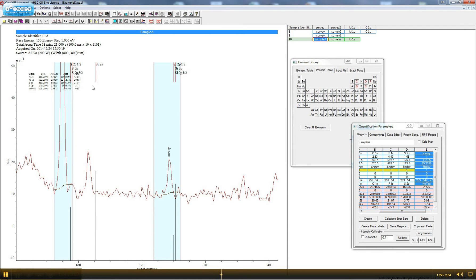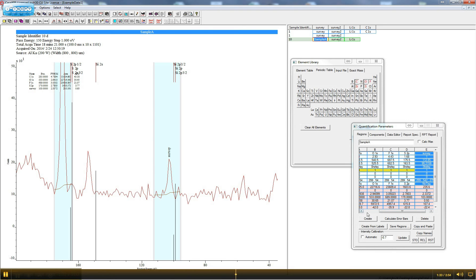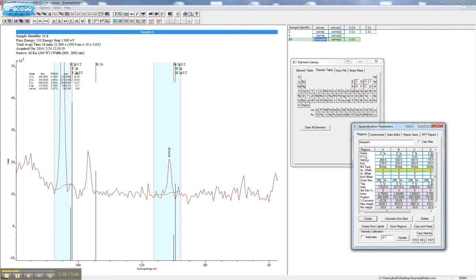Atomic percents in CASA are calculated using the peak area above the background, dividing it by the Relative Sensitivity Factor, or RSF, and then comparing with the other elements.